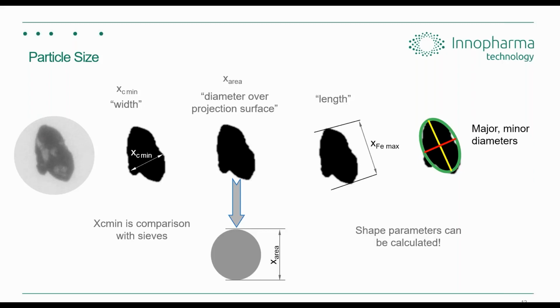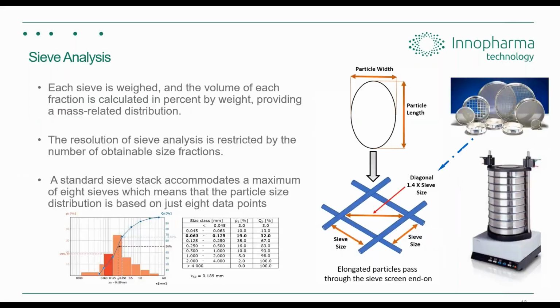And I noticed that on the poll earlier, it was particle size and shape that were most interesting to people. So that's good, because image analysis systems are very adept at also detecting shape analysis, unlike some other laser diffraction systems that can't do that. Okay.